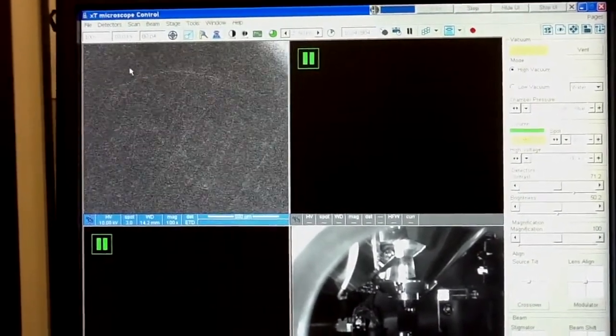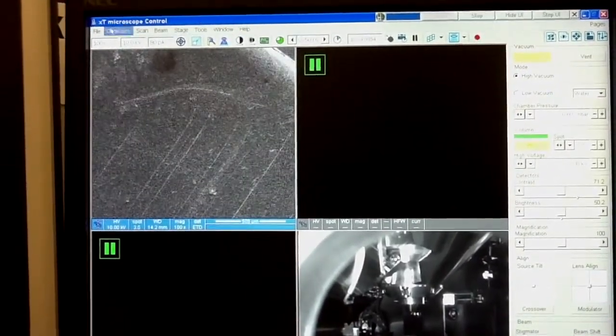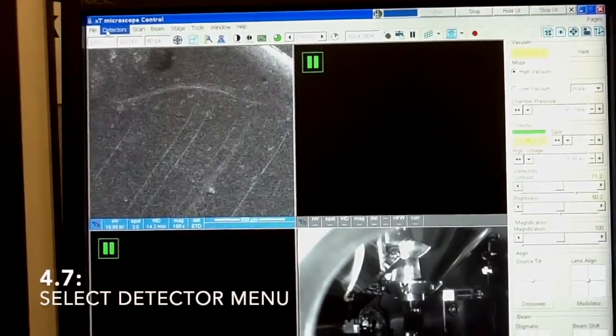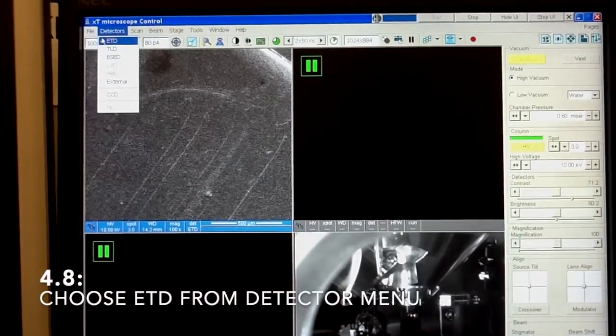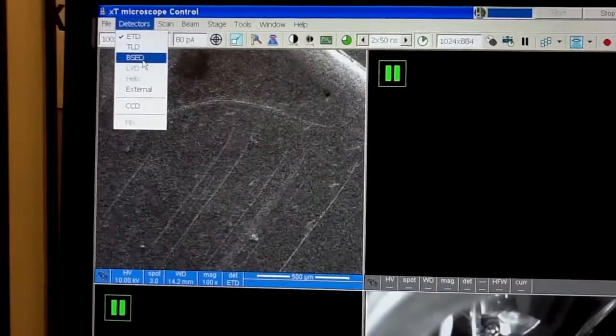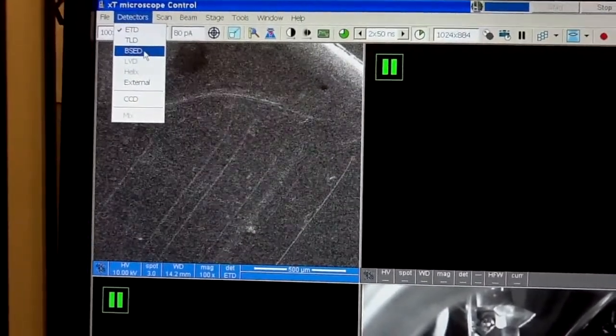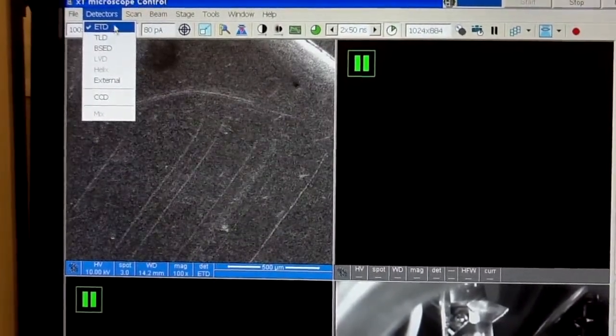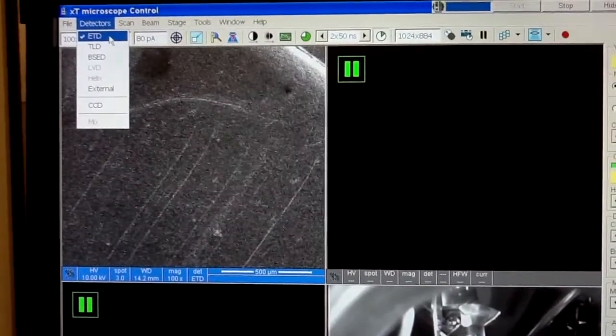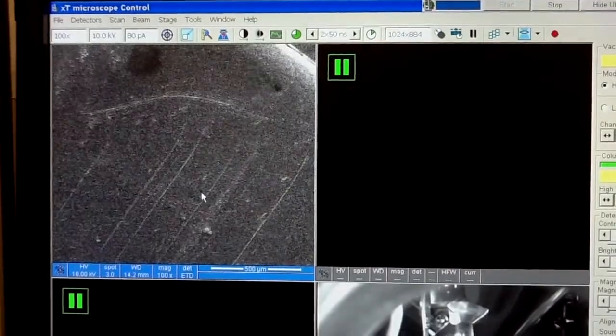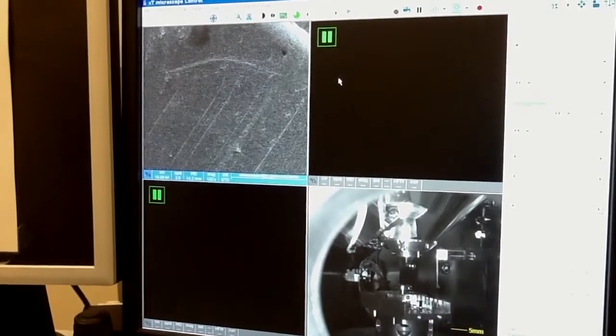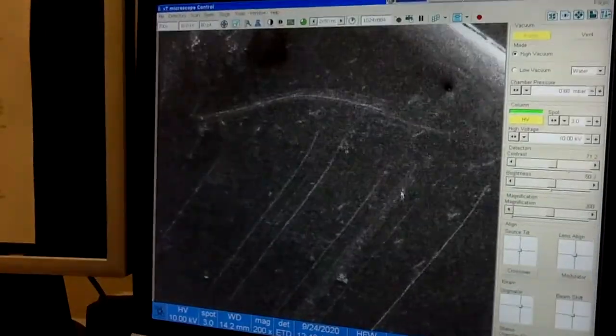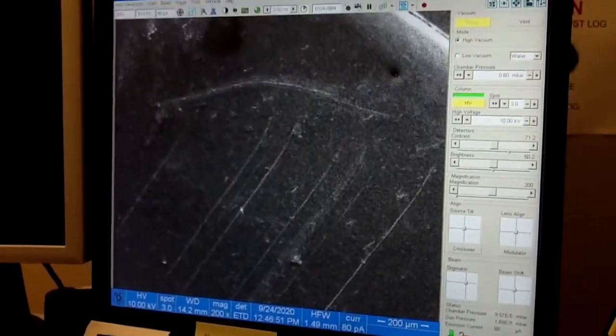But now what you see here really depends on what detector have you selected. For most of the work, we should select this detector, which is the secondary electron detector. We have an additional detector, but this needs to be mechanically inserted. It's only available if you prepare the chamber. If you don't see anything, then there is something wrong with the detector selection. So make sure that you have this one. And then you should see this kind of image. By pressing F5 button, you can go to four area view to single area view, which at this moment can be useful.